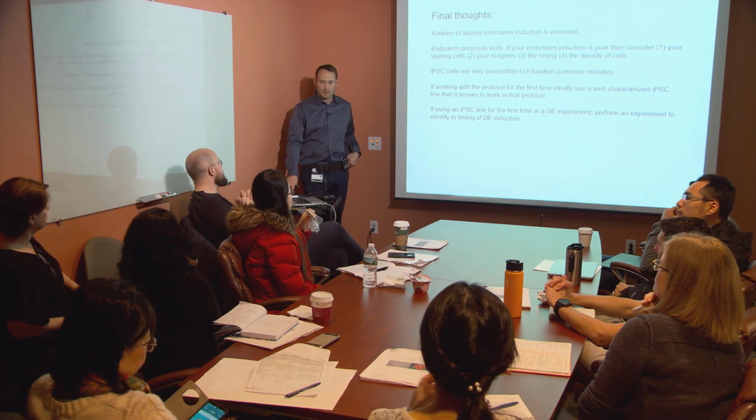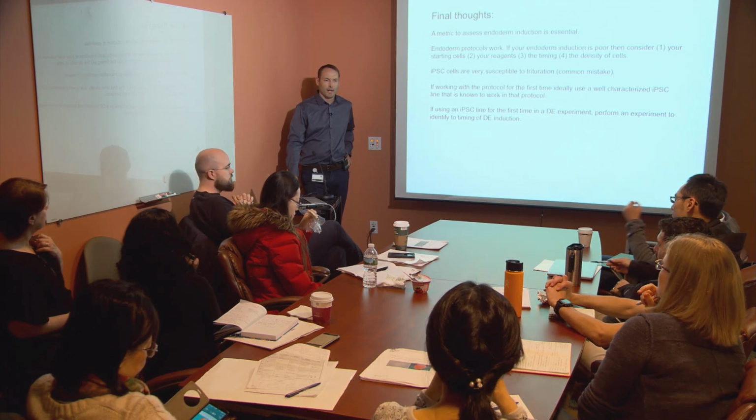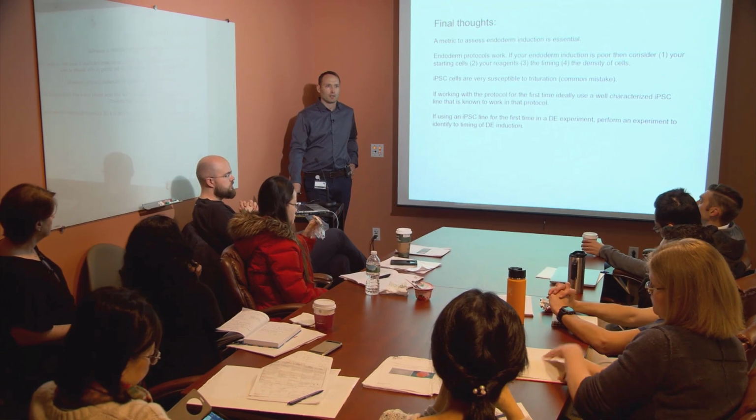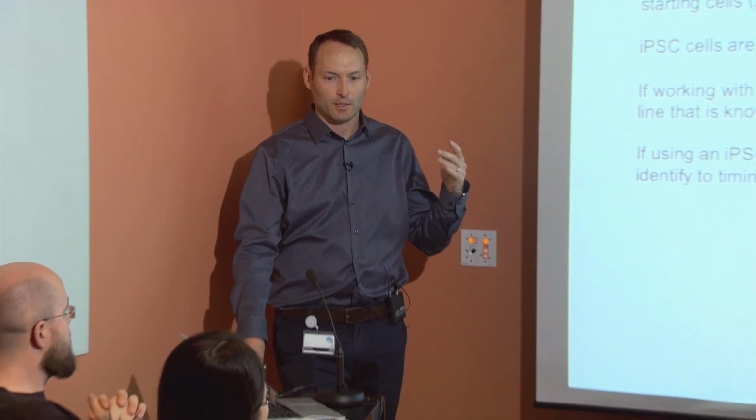Do you have any experience differentiating type 1 or type 2 cells? We have experience differentiating to type 2 cells, yeah. Is it successful? I think so. The background is that probably 3 years ago, Hans Snoeck published that if you kept the cells in a combination of CHIR, FGF10, KGF, dexamethasone, and cyclic AMP, after about a month you started to detect some surfactant protein C expressing cells, along with a diverse expression of different lung markers. There was some SPC.